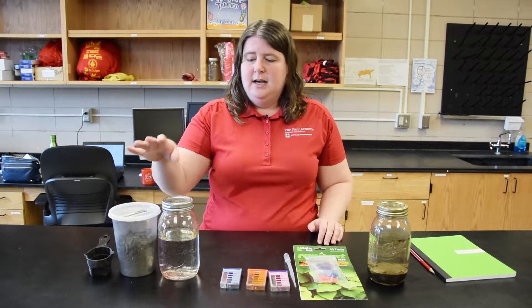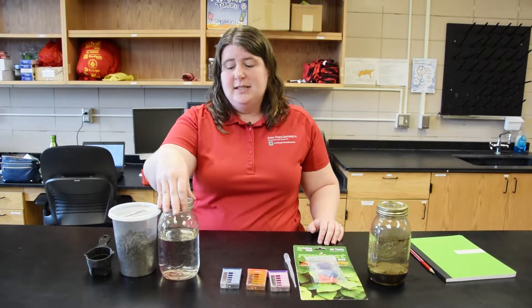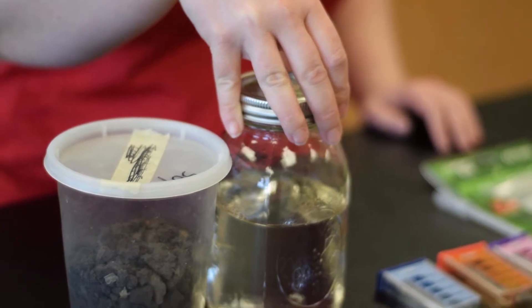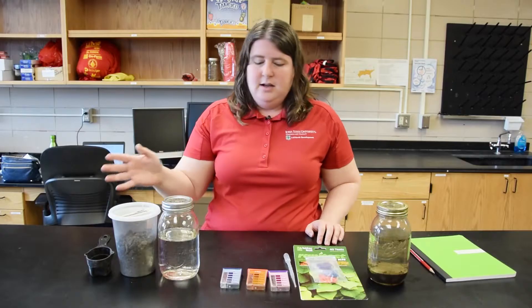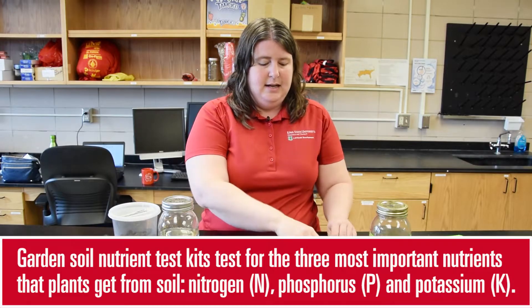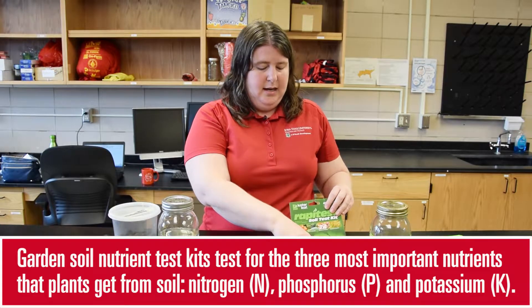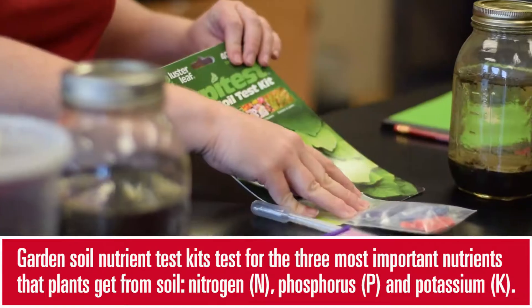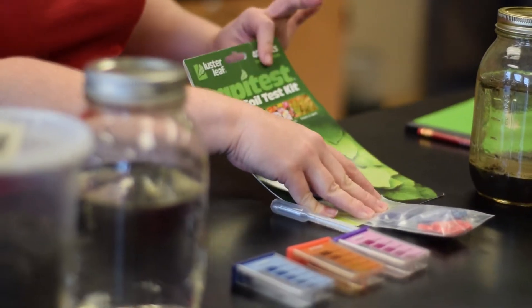For each soil sample that you're going to want to test, you'll need a clear sealable container. I think that mason jars work well for this experiment. You'll also need a soil testing kit. You can buy these at any garden center or online. This kit comes with the testers and the chemicals that you need to do the soil test.